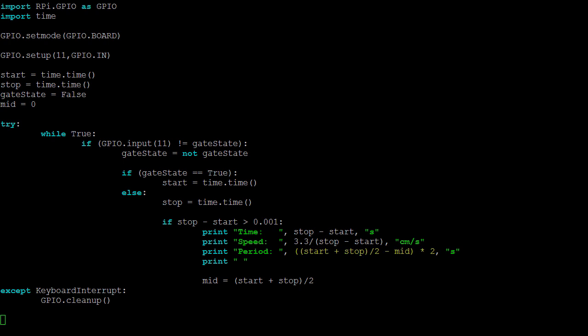To calculate the period, we find the difference between the current midtime and the previous one, and then multiply this value by 2. We need to multiply by 2 as the difference in times is only for half of a complete swing.